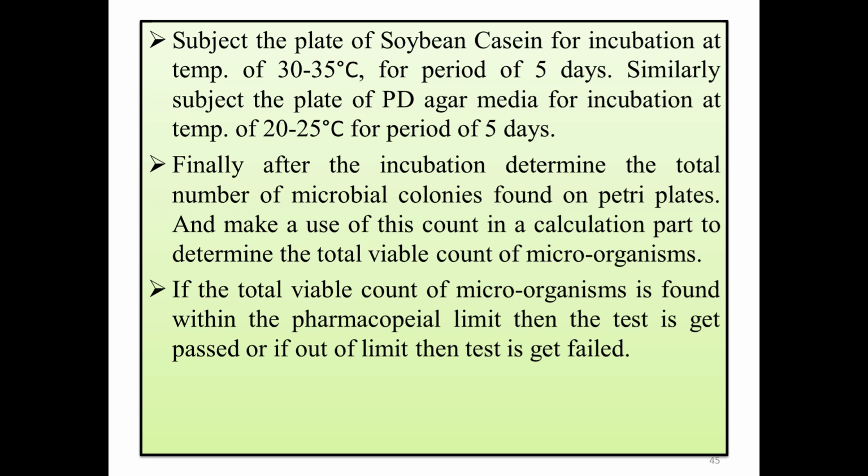If the sample contains microorganisms or is contaminated, it will show microorganisms. So these colonies of microorganisms are counted and then used in the calculation of how many viable microorganisms are there in the specific sample.